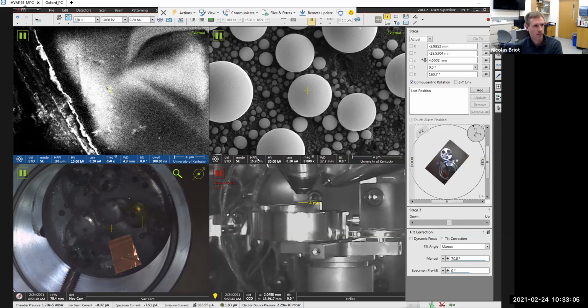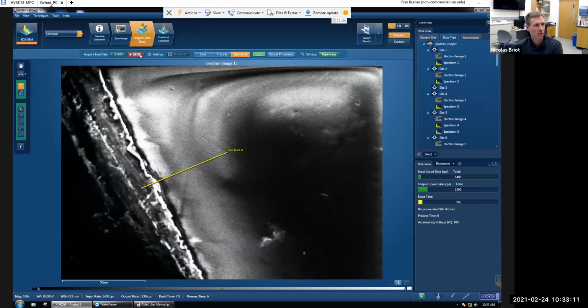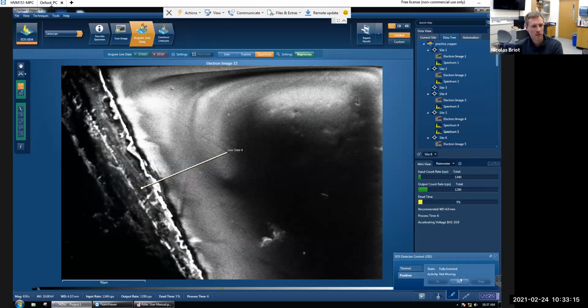Okay. All right. So what I'm going to do is stop that line scan, and let me retract the detector.